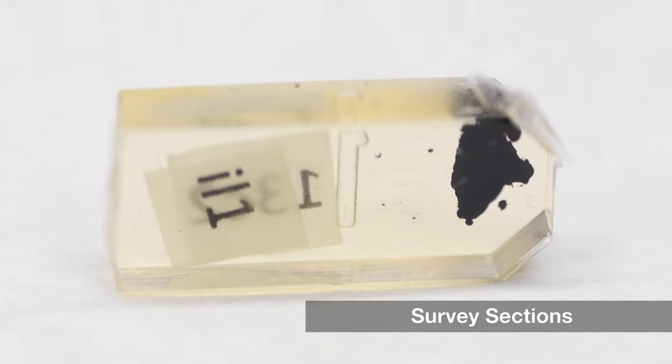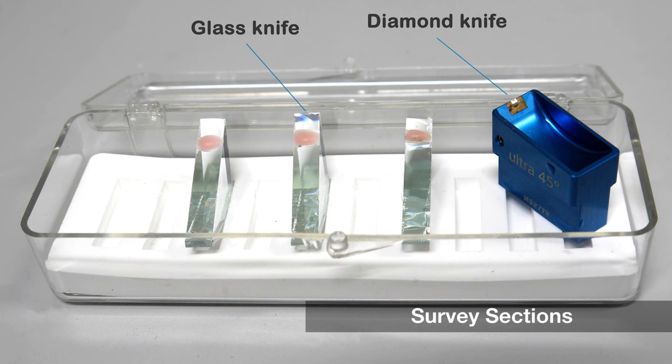Since the resin is very hard, sections can only be cut using glass or diamond knives. A glass knife is made from a strip of glass.